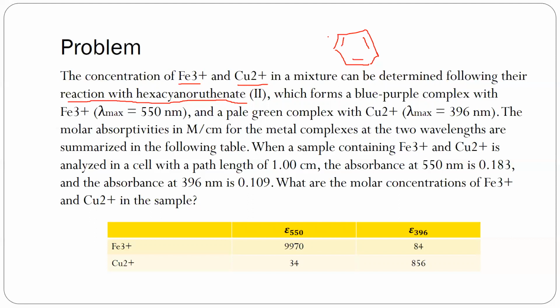Remember, in your amino acids, there are amino acids that are UV active, and the reason why is that they contain the benzene ring like that. Kasi the benzene ring can absorb UV and visible radiation. So yun yung requirement para makapag-absorb ng radiation na yun.